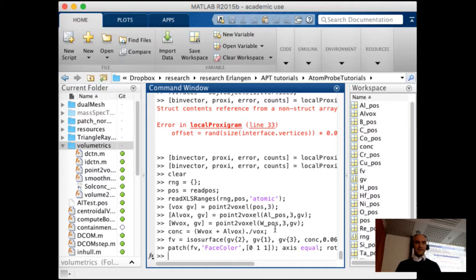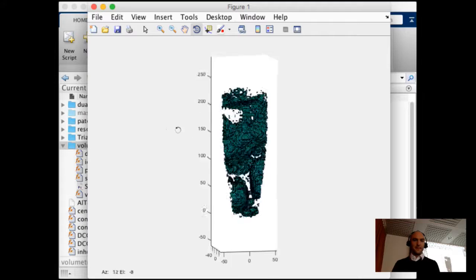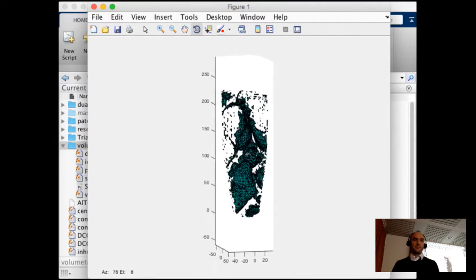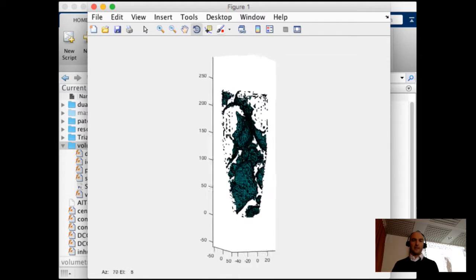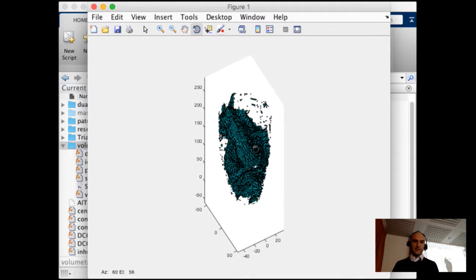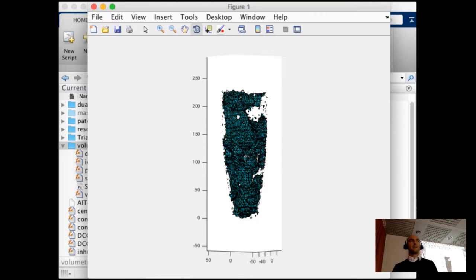For everyone that already has an isosurface, the next thing we're going to do is actually pick a specific isosurface. Because you can keep working with whatever it is, but probably if you're working with an isosurface, you might want to pick a specific one. And the other thing you might want to do is get rid of all that lint that's clinging on. You can't see it that well from just looking at it, but all of these little patches are at the surface of the data set.